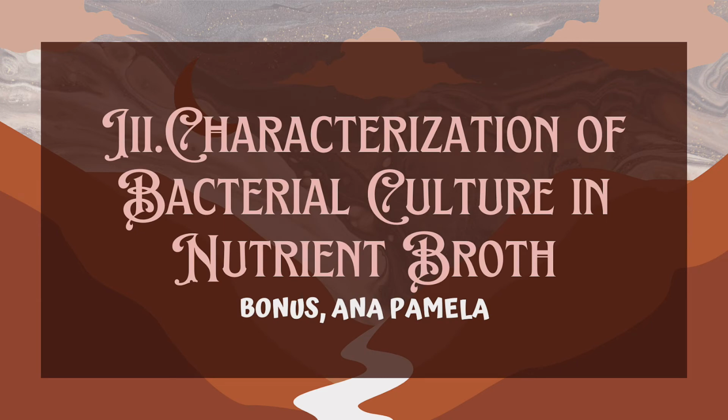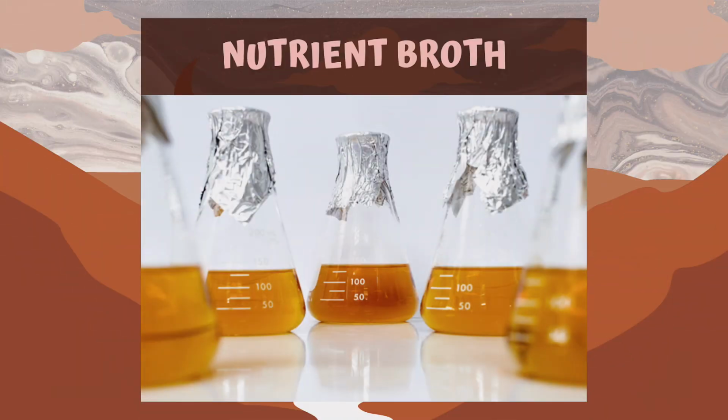Now that we have an idea on the different characteristics of bacterial growth in agar plates and agar slants, it is time for a new media, representing our nutrient broth. Before I talk through the characteristics that can be observed on bacterial growth in our nutrient broth, let's refresh ourselves with what is nutrient broth and how do we make it. Of course, the quick and simple way. So, what really is a nutrient broth and what is it for?